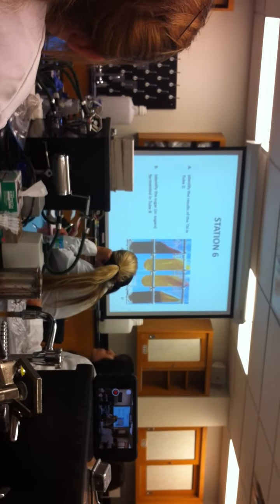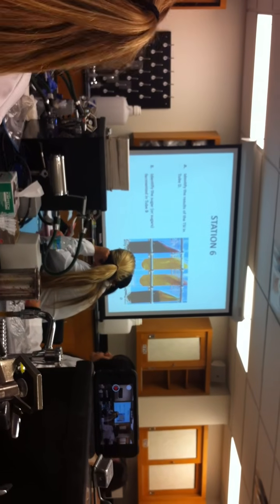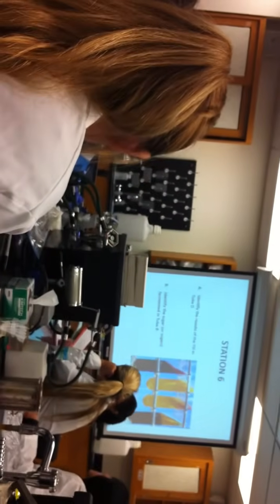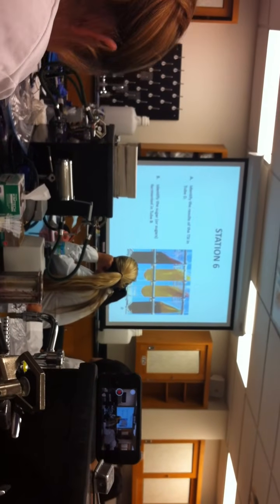So even though it's asking about a different tube, it'd be the same in this situation, they all have the same sugar content? Every one of them has the same stuff in these tubes. Okay. So what you can make a distinction is if a bacteria grows on any of those tubes on just the butt, it can only live on monomeric sugar or glucose. If it is growing in everything, it must have the enzymes to use disaccharides.